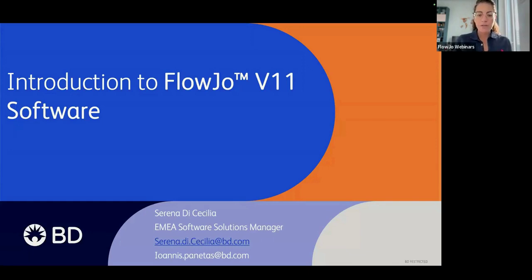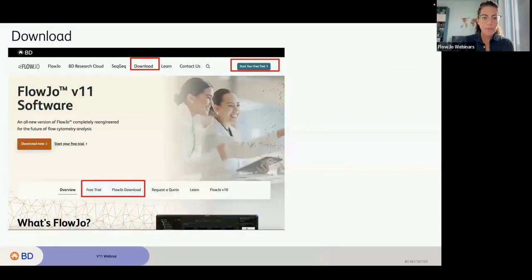Okay, so I think I may get started. The first thing to know is that today this will be a webinar on FlowJo version 11. FlowJo version 11 is the newly released version of the software. It's a modernized, updated version, and it was released back in May. You can download it from the website as you downloaded FlowJo version 10.